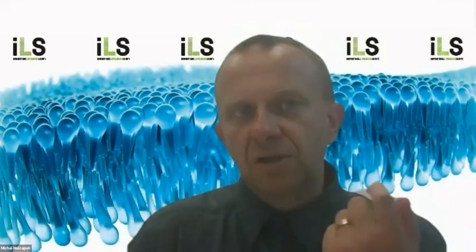Okay. And the second question is about your software that came out. I think I got a Twitter message about this new software. Can your software work with, for example, I think you mentioned it, the SPLASH mix from Avanti, or is it dedicated to your own internal standard mixture? With any internal standards, it does not matter. You simply set it. So any internal standard will work, but you need to use at least one internal standard per class. You set the concentration and then it works. Okay. It's easy. I think we will look into it.